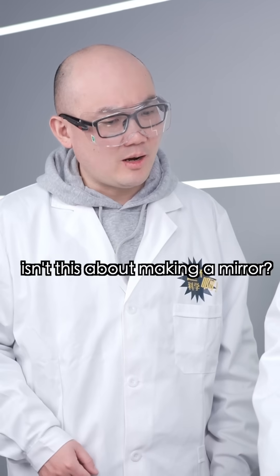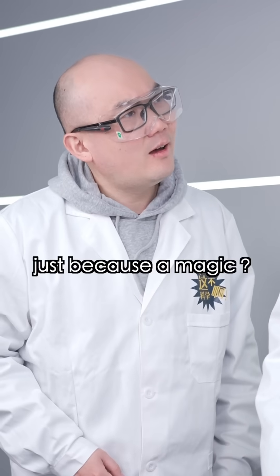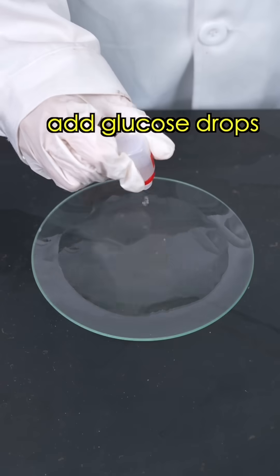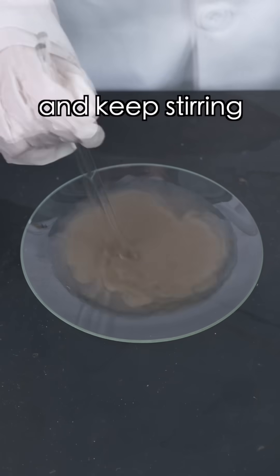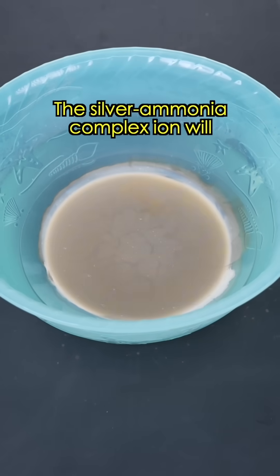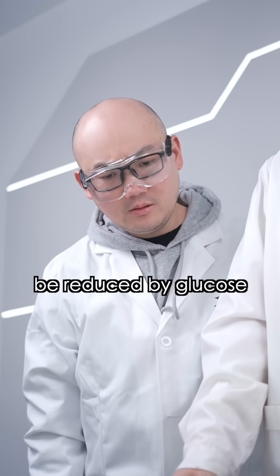Wait, isn't this about making a mirror? You think I'd forget because of a magic trick? We're about to witness a miracle. Pour the solution onto the surface dish, add glucose drops, and keep stirring. Finally, put it into hot water. The silver-ammonia complex, under alkaline conditions, is reduced by glucose.